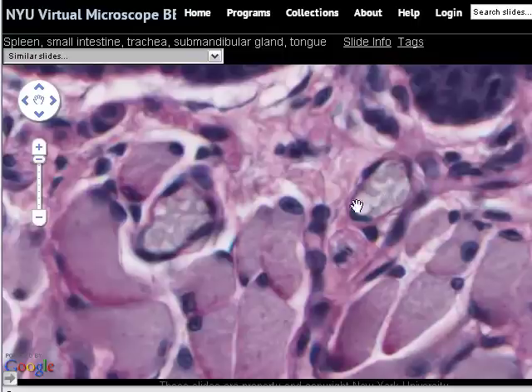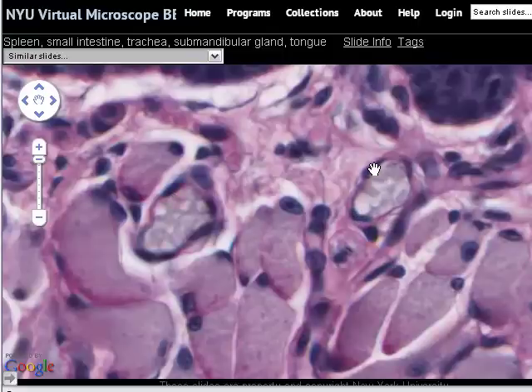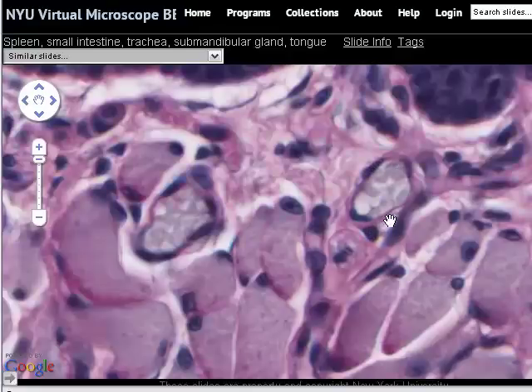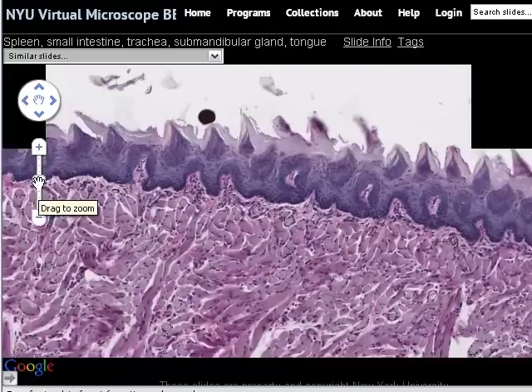There's a small venule here and a small venule here. The purpley-mauve material in the middle is actually red blood cells trapped in the vessel when the tissue was prepared. These little venules are essentially made up just of a layer of endothelial cells with maybe a little connective tissue outside. Here's an endothelial cell nucleus, here's an endothelial cell nucleus — and just along here is the very delicate little layer of connective tissue that surrounds them.